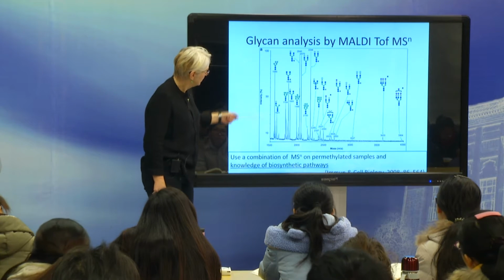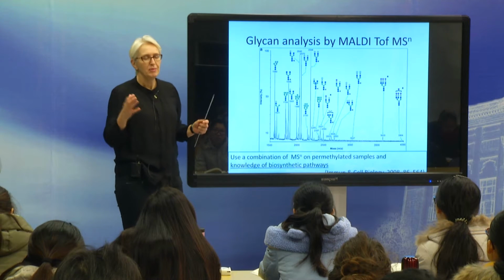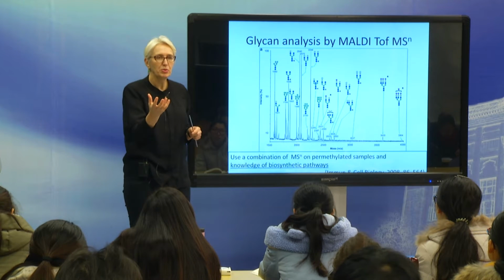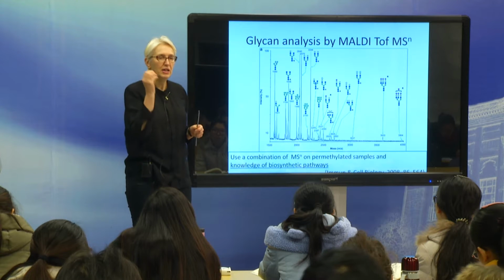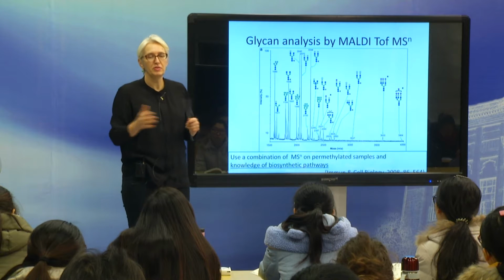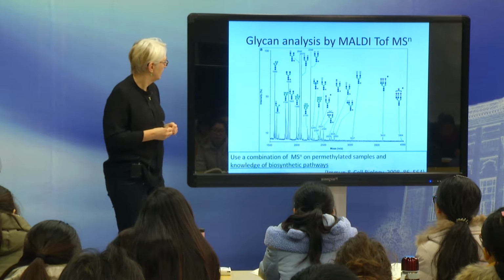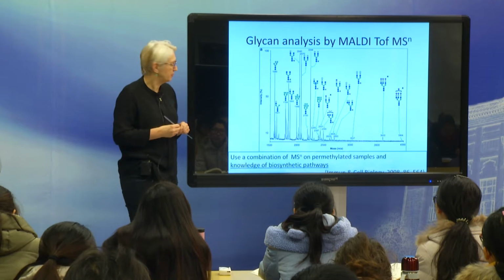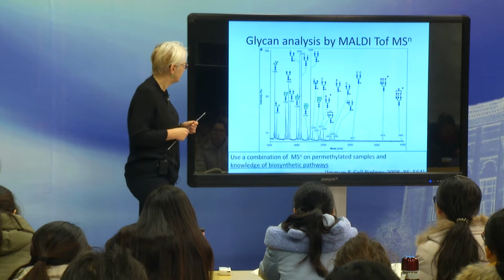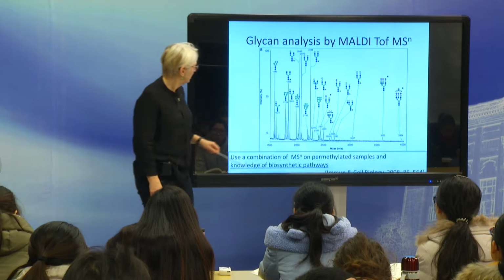This is the intensity. If you have a mixture of glycans, and I'm not sure whether I've stressed this, when you look at a glycoprotein, and this is actually the issue, it's never homogeneous. A single sample of, let's say, EPO, will always have a whole mixture of different glycans. You get a lot of heterogeneity on each protein in terms of glycosylation, which makes the analysis very, very difficult. So I think this comes truly from cells rather than single proteins.